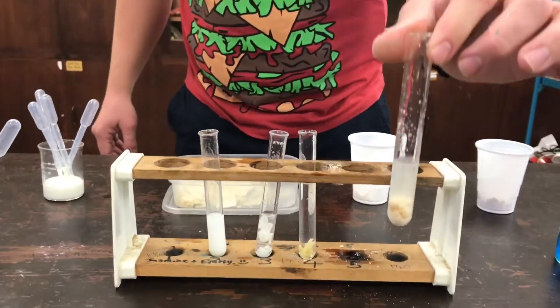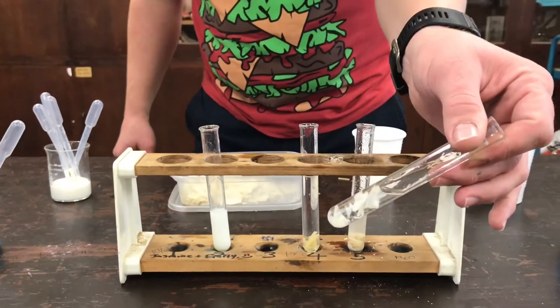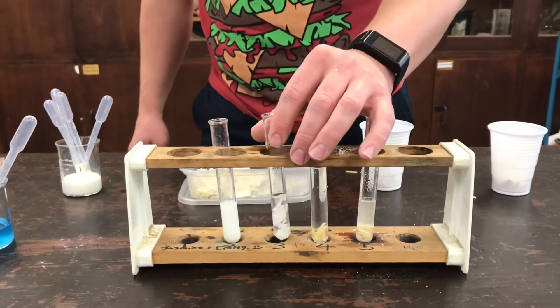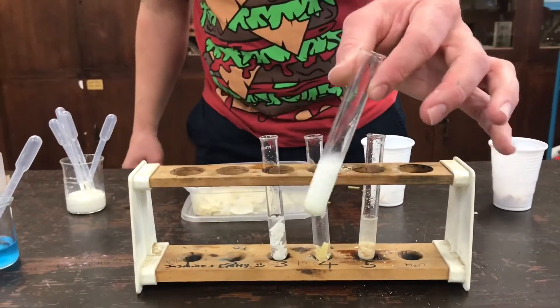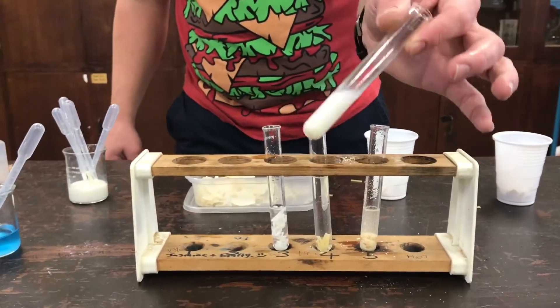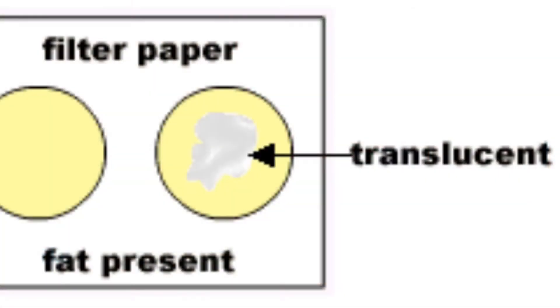As you can see I've got a bit of fat here in the biscuit. There's quite a lot of fat showing up in the crisp. Not so much fat at all — hardly any in the pasta. And the milk — we can't really tell, but it will separate and there is some fat in the milk that we'll find at a later time. You can also use filter paper to witness the presence of fat.